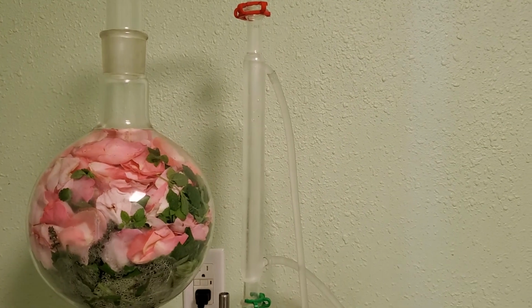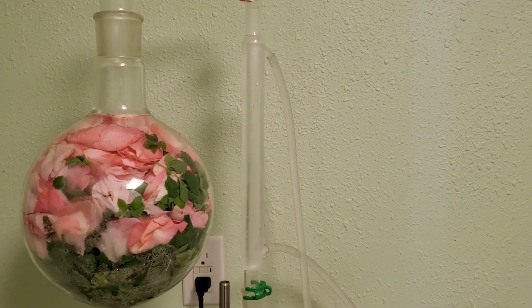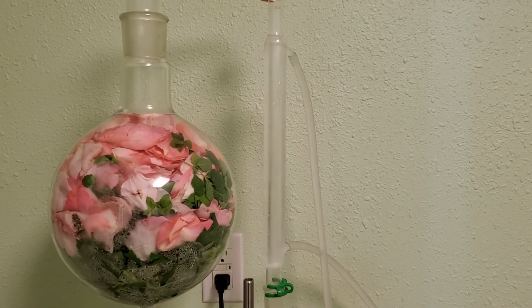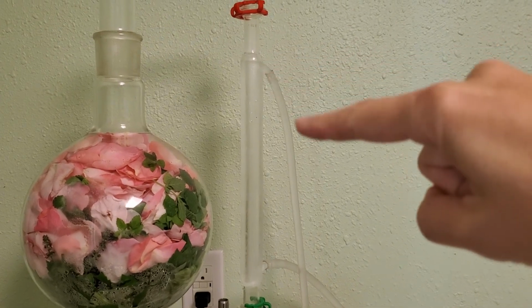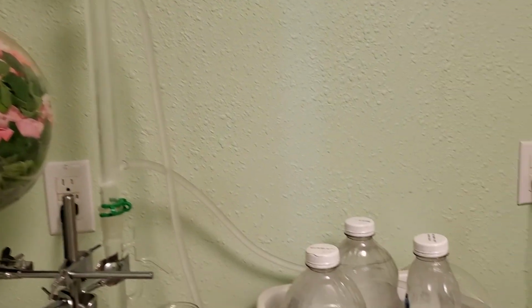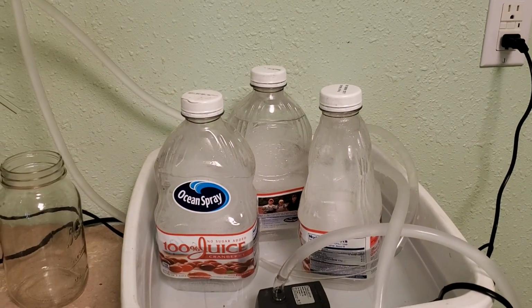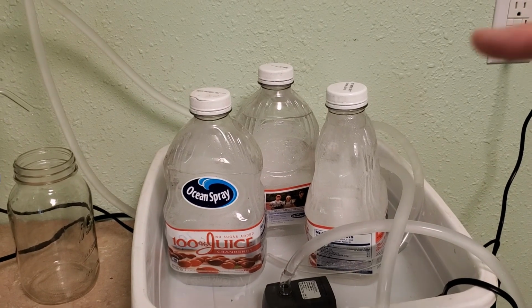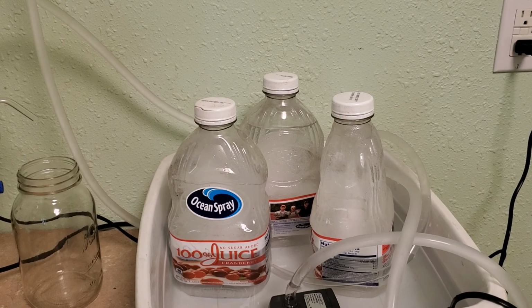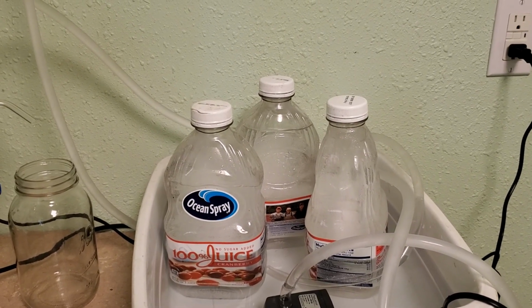So in the condensing unit, there are actually two different sort of like pipes, I guess. And so coming off, there's this one tube, and then there's this tube. That is actually connected over here to our aquarium pump, and it is pumping cold water. So these are cold ice packs, and there's just regular tap water because it's not going to touch or come in contact with the distillation that you're doing.